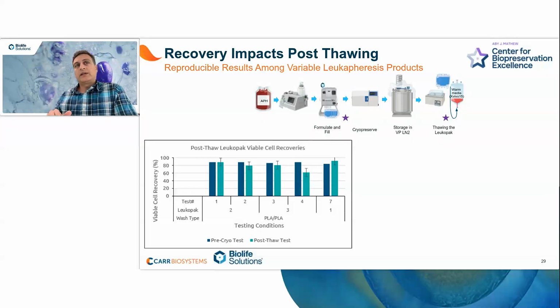And the wash type in all of this data was Plasmalyte. Plasmalyte meaning that the cells were platelet washed with Plasmalyte HSA, and then they were eluted in Plasmalyte HSA into a final bag. And then at that point, CryoStor CS10 was added to that bag in a closed fashion using our CryoStor 1-liter bag that was aseptically connected, sterile connected, welded into the formulation bag, with a 1-to-1 weight-based addition of CS10, and then they were filled and cryopreserved.